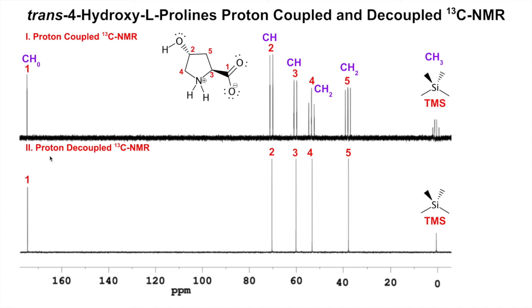I'm going to tell you how that decoupling occurs shortly. You might wonder, this was pretty informative. Why don't we always do it this way? You'll see it's not always this clean. So now we'll just move on to another example of that.